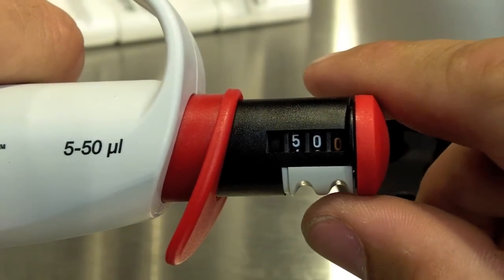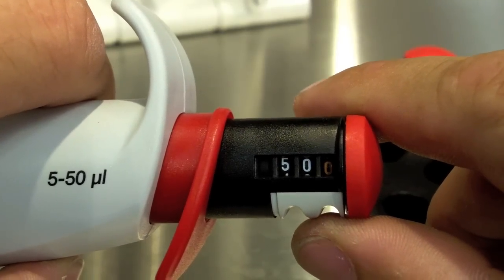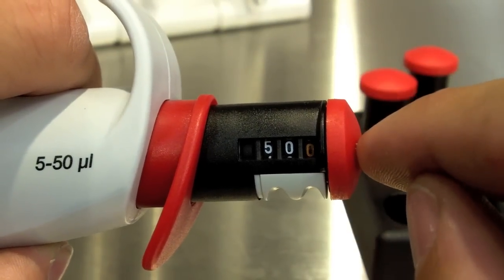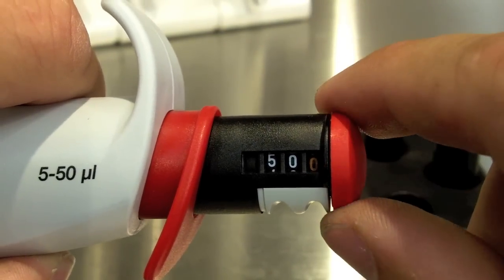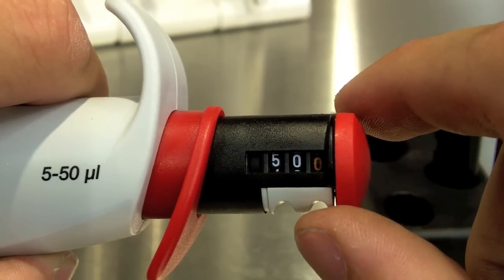Calibrating a cap pipette is also very easy. Let's say through your volume verification you discovered that this pipette was dispensing 49 microliters instead of the 50 microliters it is displaying.